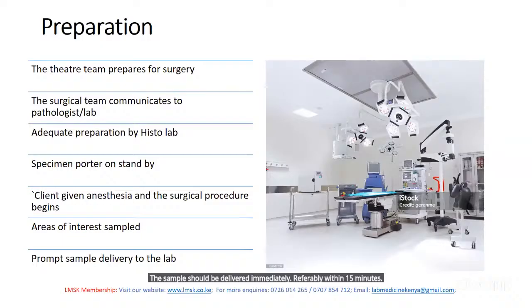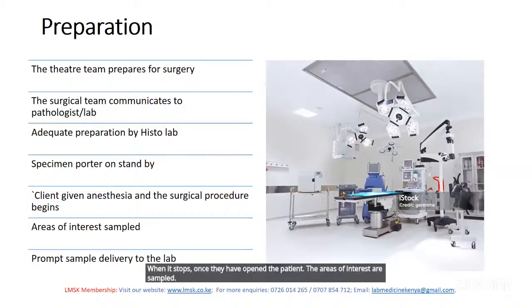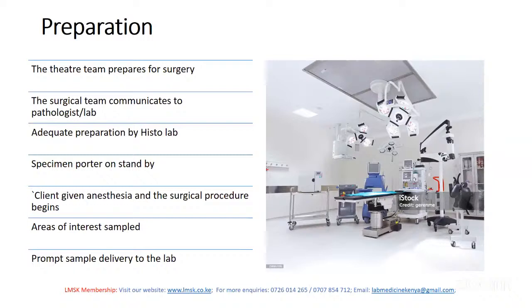Then the client is given anesthesia once they're ready, and the surgical procedure begins. When it starts, once they have opened the patient, the areas of interest are sampled, and the sample is then promptly delivered to the lab by the porter who was on standby.